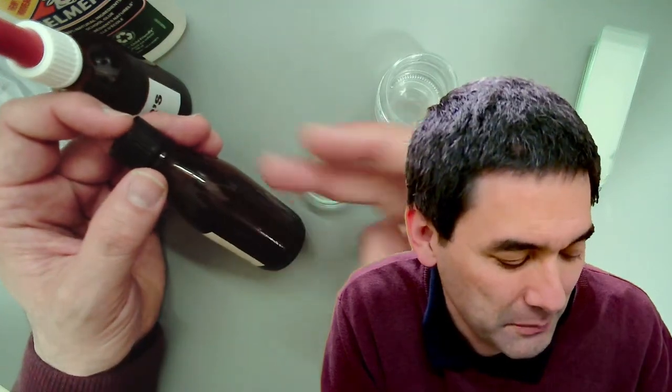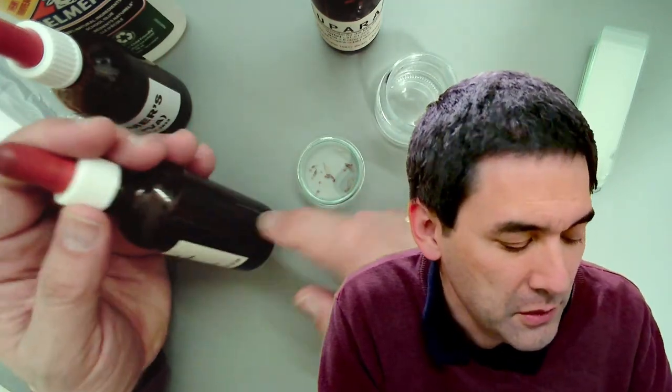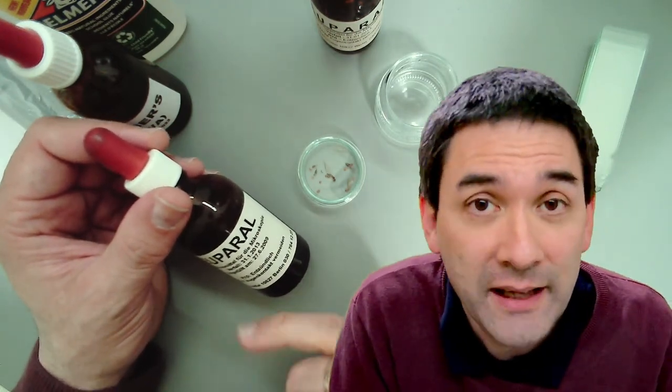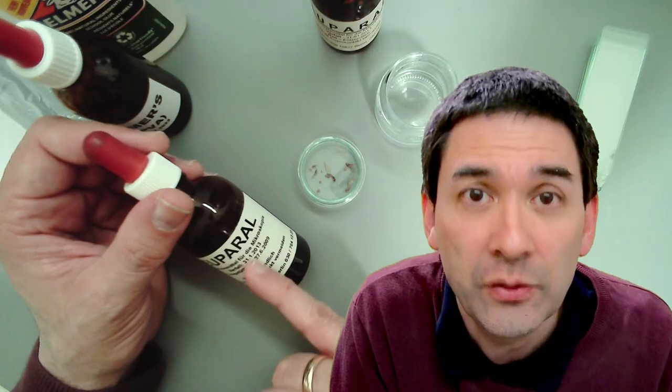I've used it, but there was simply so much in it that I still had a lot left. I also filled some over here, and I'll be using this because Euparal has one significant advantage if you want to mount insects and mites, animals with a so-called exoskeleton. The advantage is that it has a so-called clearing action. It makes the specimen brighter for whatever reason.